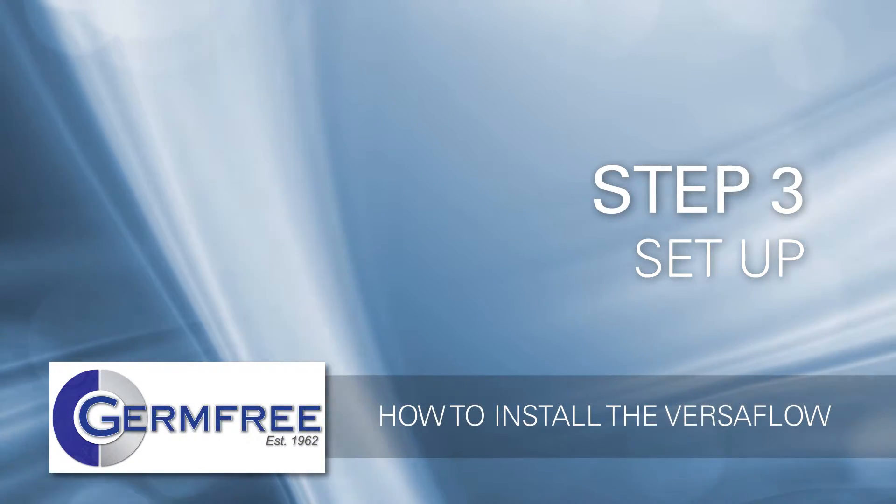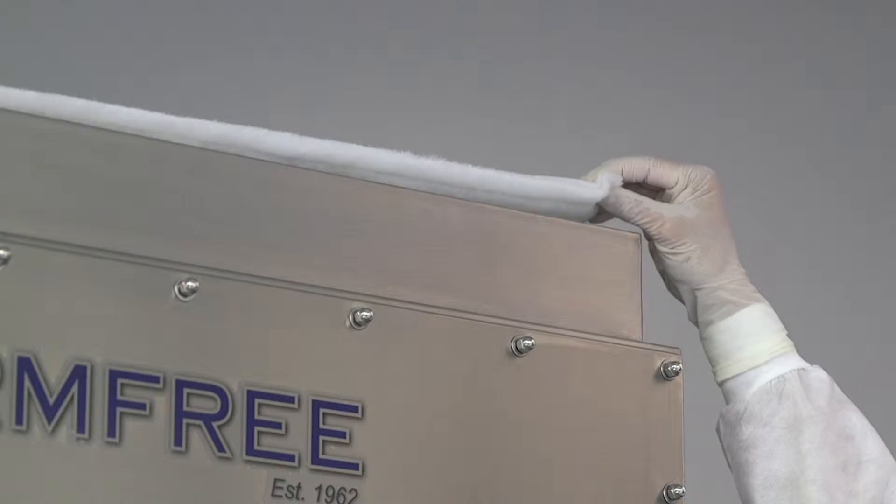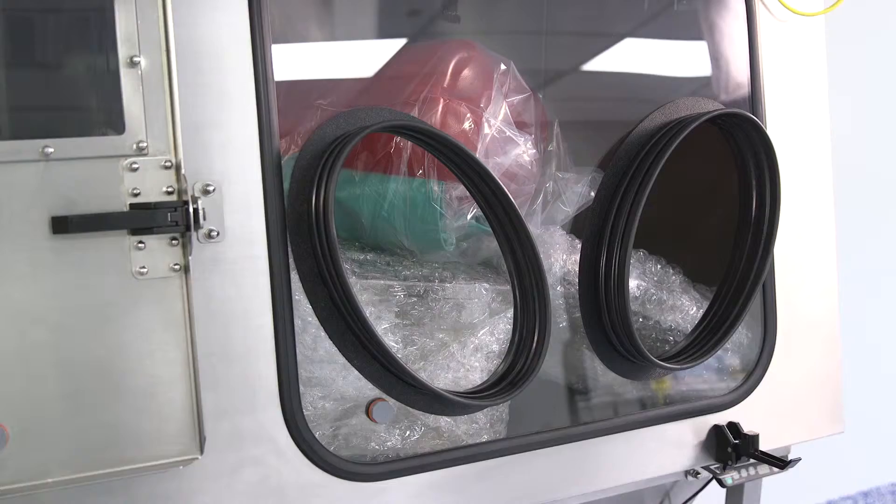Step 3: Set up the Versaflow. Put the pre-filter into its frame at the top of the unit. Part of your pre-filter may remain visible after it's set in place. This is normal.